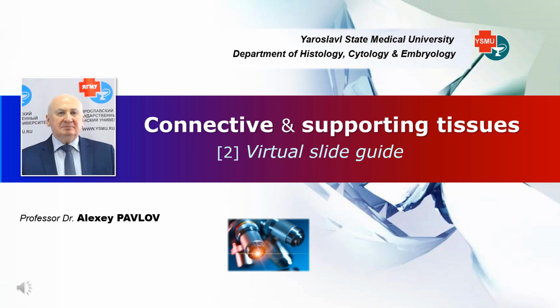The widespread implementation of virtual microscopy technologies in teaching histology opens up new opportunities for each student to develop not only theoretical knowledge remotely, but also skills in navigating histological specimens, identifying their microscopic elements, accurately describing the features of their structure and function. This lecture is dedicated to developing such important diagnostic skills related to the topic of connective supporting tissues.